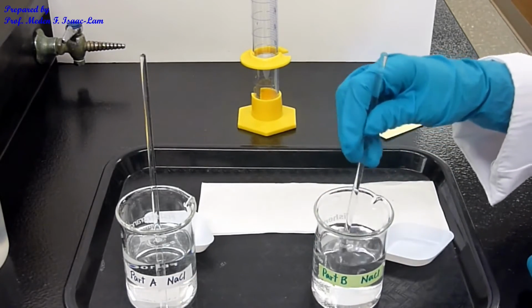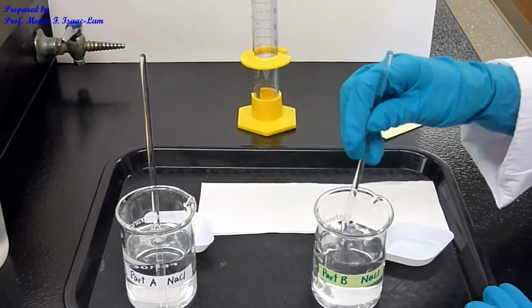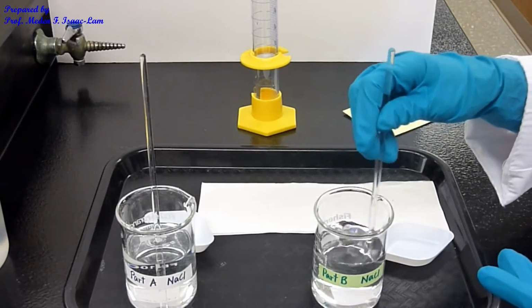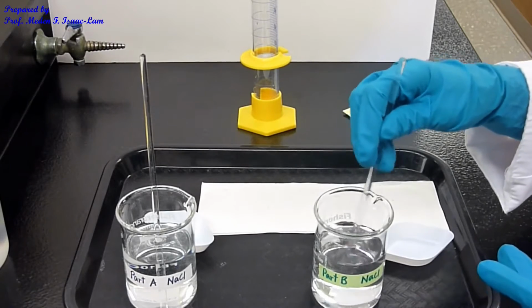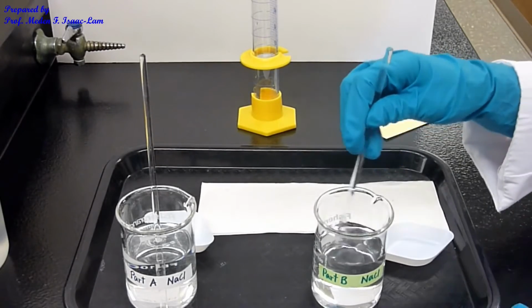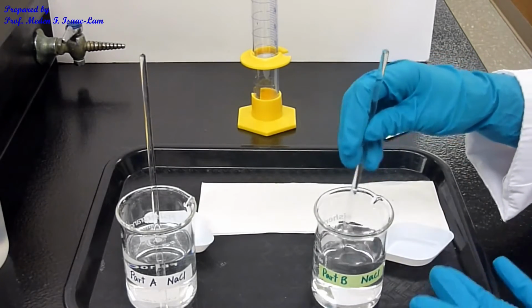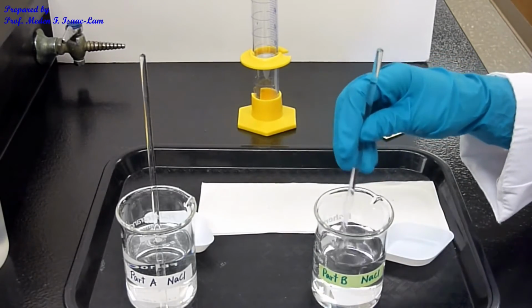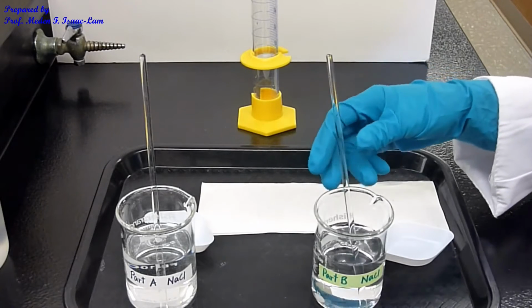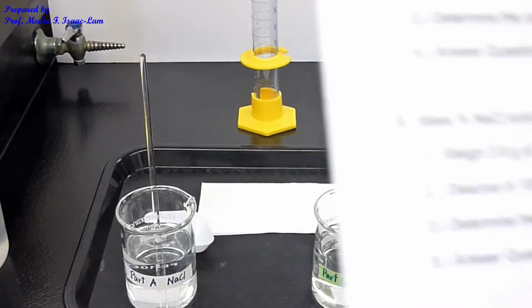So once it's dissolved, we're going to compare. So it should dissolve faster. The same thing, solution. When you make a solution, it should be transparent, clear. You don't see any separation of the solute and then the solvent. So again, the same thing, the solute here is NaCl, solvent is water. And you are now going to determine the concentration in terms of mass percent.